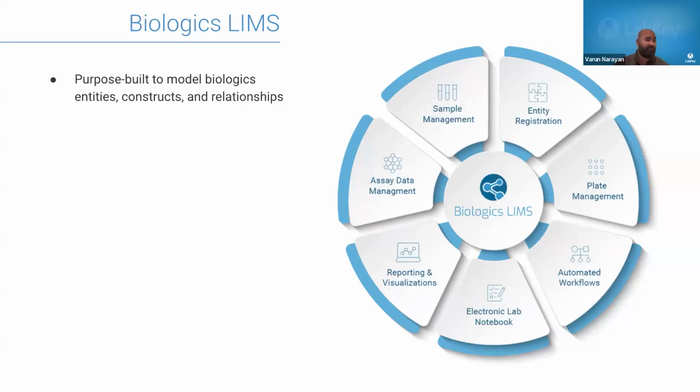And being able to register it in whatever variety of ways your processes work, whether that's utilizing the UI, utilizing file imports, or utilizing APIs programmatically. Being able to easily consolidate the data that you have for whatever entities you're working with in one place is something that's baked in to the Biologics LIMS product.